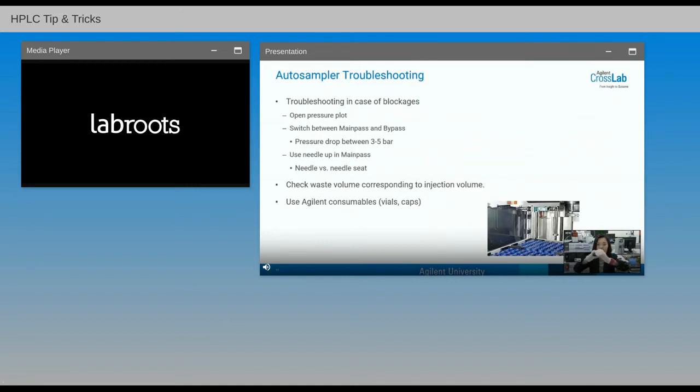It means the injection valve itself, the groove on this injection valve, may leak inside because of heat and switching, right? Then you may have scratches. The scratches are the part that causes the cross port leak. Or even sometimes, if the injection valves are not tight enough, there is some internal leak. So all these leaks will affect your peak area, because the sample being introduced into the column will no longer be consistent, and the sample amount being introduced will affect the area count.